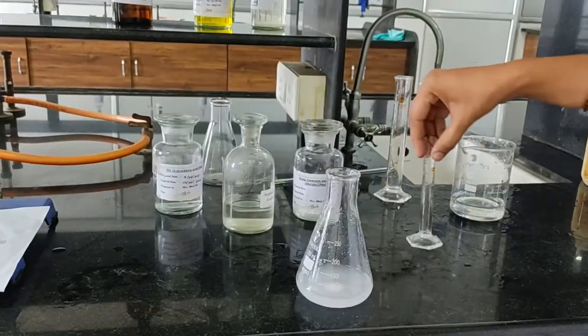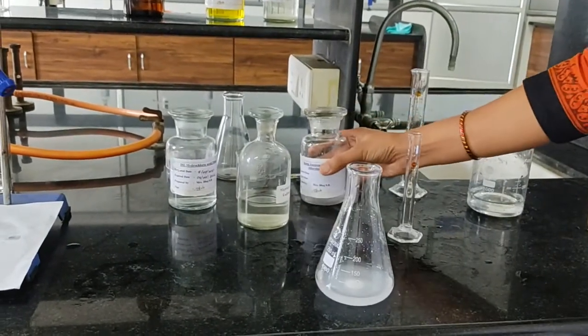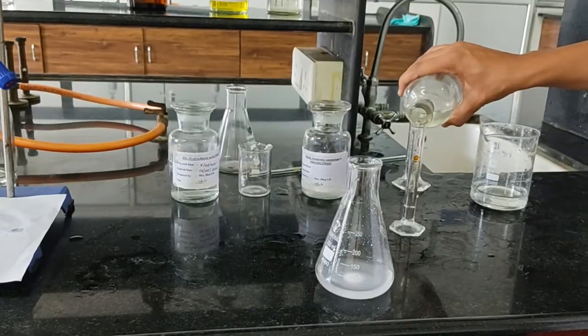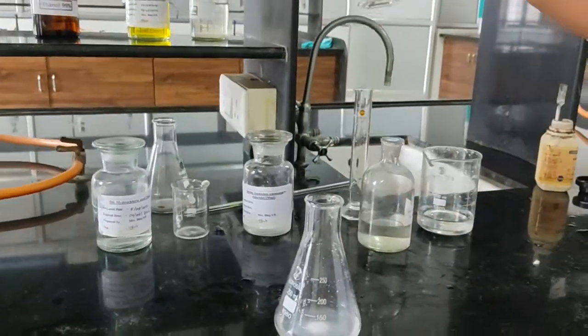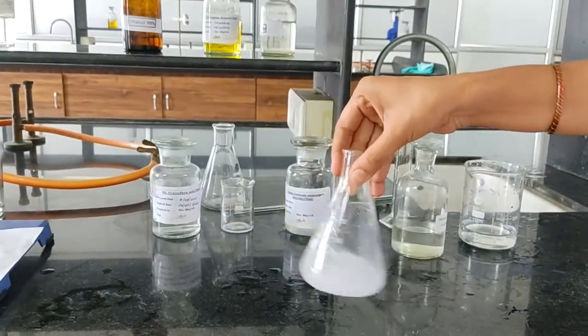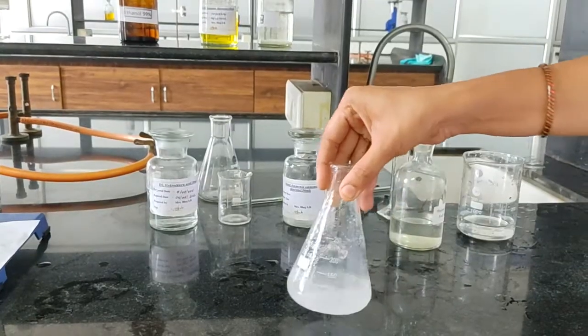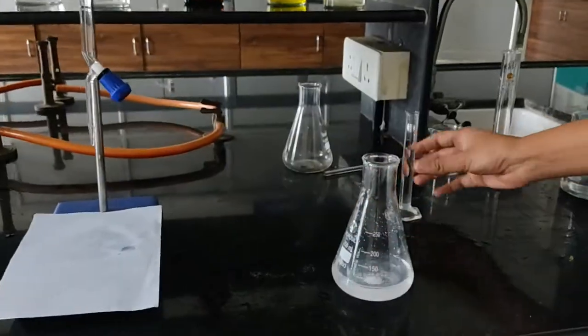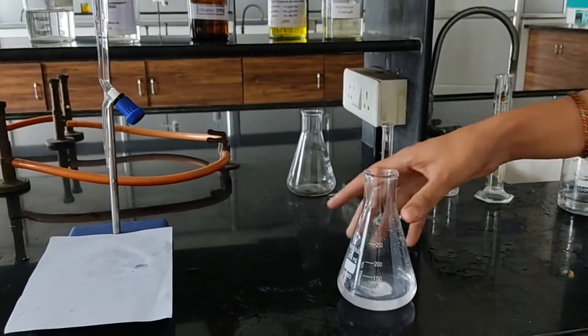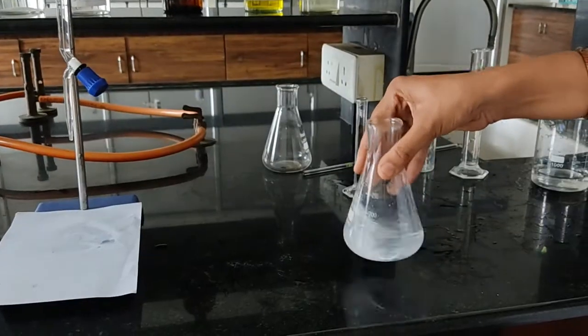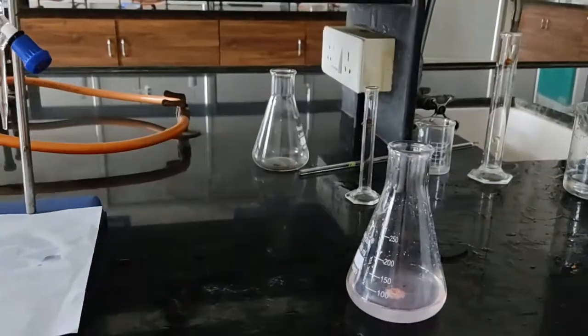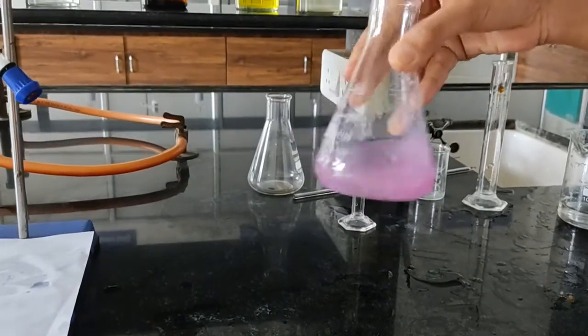Now add 50 ml of distilled water into the conical flask and dissolve calcium gluconate into water. Now add 5 ml of 0.05 molar magnesium sulfate into the conical flask. Again mix it properly and add 10 ml of strong ammonia solution. Add 10 ml of strong ammonia solution into this solution. Again shake it properly and finally add 0.1 gram of Mordant Black Second as indicator. We got pink colored solution.